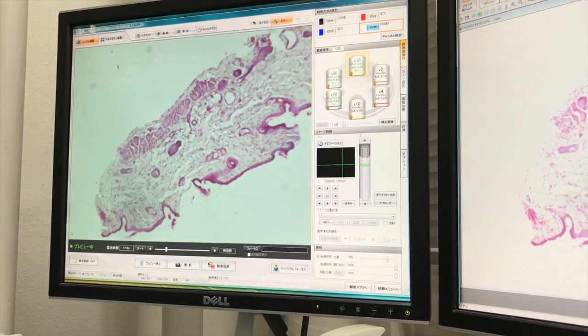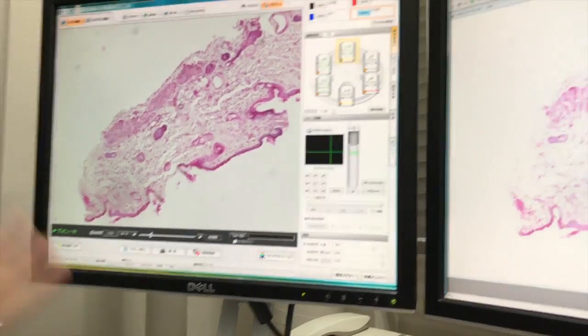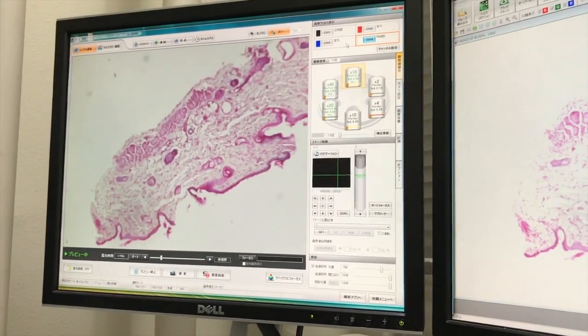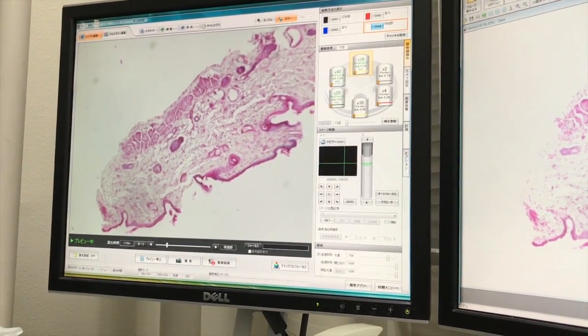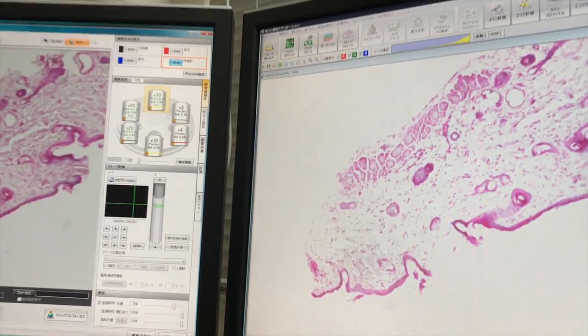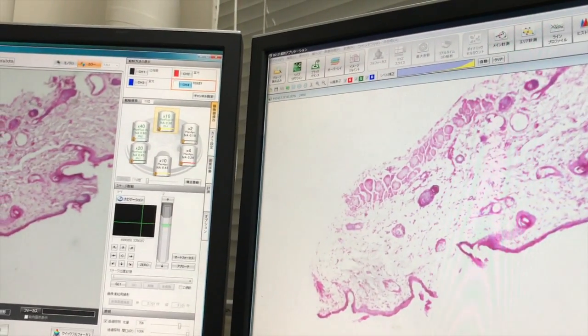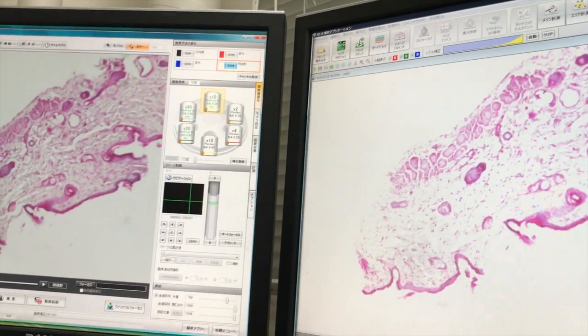Now hold it. Shut down. Shut down. Just switch off and switch off this one. Just like this. So if your image is not saved, it will ask you... Do you want to save first before? Okay.